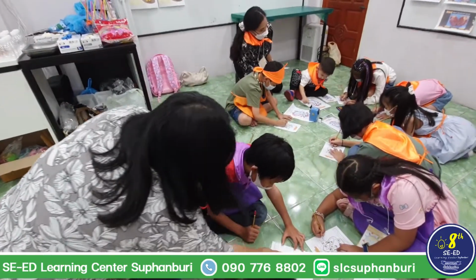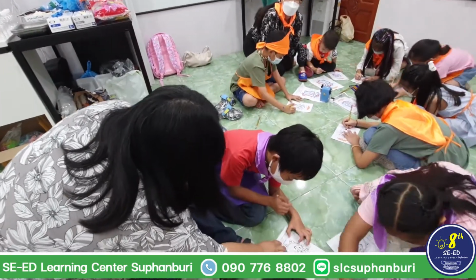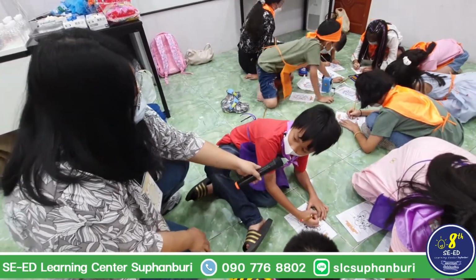Is it left or right then? Your hand is left, but for the picture, is it right or left? Right. And oh, sorry, atrium or the ventricle? Yeah. So that one, how can we call that one? Right, when you call, the right ventricle.